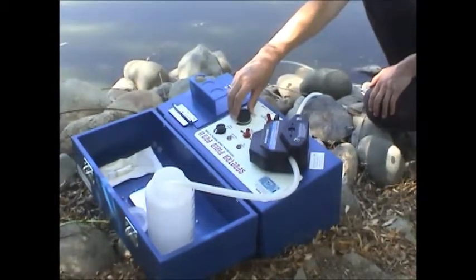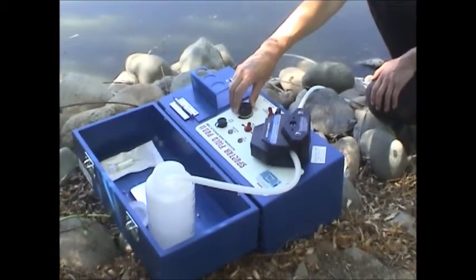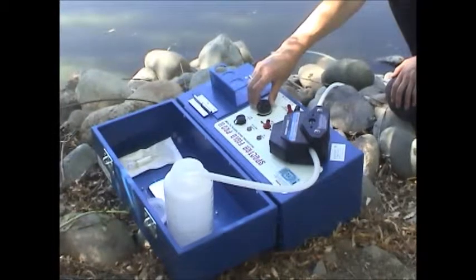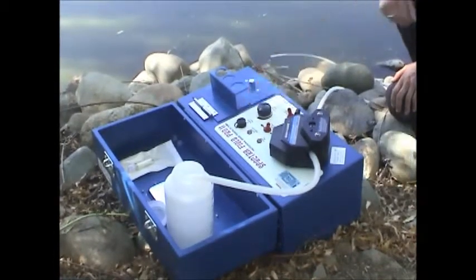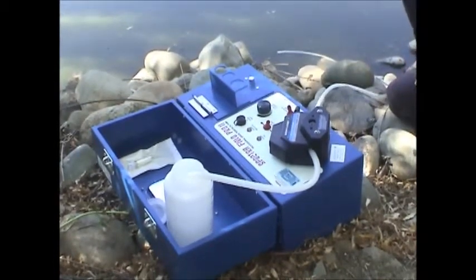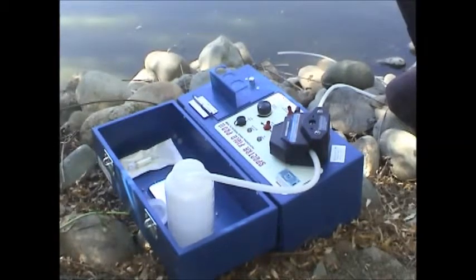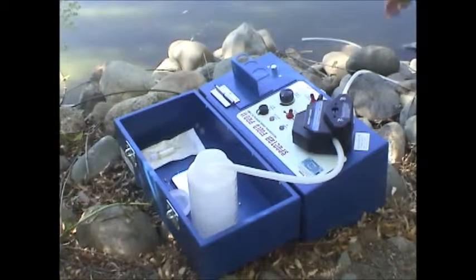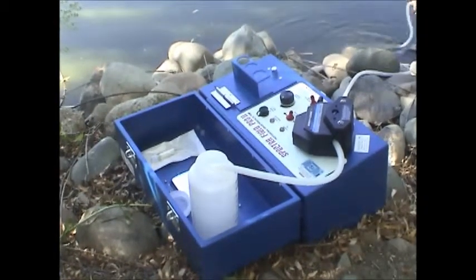Turn the pump on and then adjust the rate. We're suggesting about 12 o'clock — probably an okay setting. You're not going to get real fast flow through the filter. If you turn the rate up high you'll just build up more and more pressure, and you could actually blow the filter right off the end, so you don't want to do that.